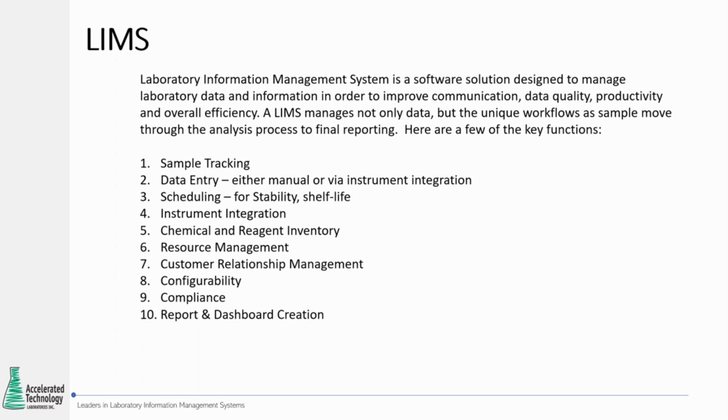Also, report creation. Automated report creation is huge. This is the biggest time saver, I should say one of the biggest time savers of having commercial LIMS systems, because reports can be automated the minute the last result has been validated and approved on that order. The report can be created, it can be PDF'd, and then it can automatically be emailed or posted to a client portal. And there's also the ability to have dashboards where you can really see at a glance the operations in the laboratory, if there are any backlogs, how many samples have been received, how many have been processed for that day. So there's a lot of business intelligence that laboratories can gain from those dashboards.